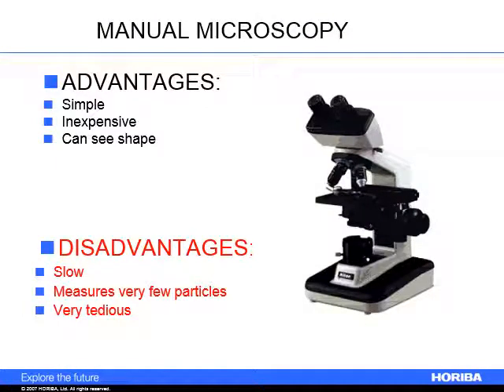I know other Steve has probably talked a bit about microscopy, maybe not so much from a particle size sense, but clearly if you can image something, you could measure the particle size of it. Your advantages are that it can be as simple as having a light microscope. Depending on the size of what you have, you might need an SEM. But typically, it's an easy way to measure the size and shape of a particle.